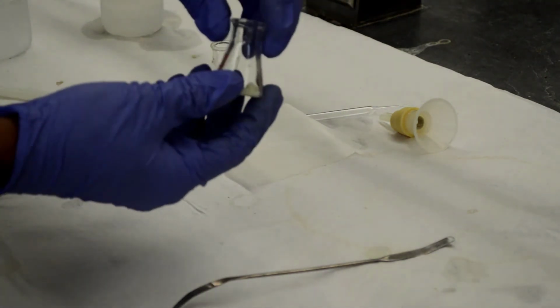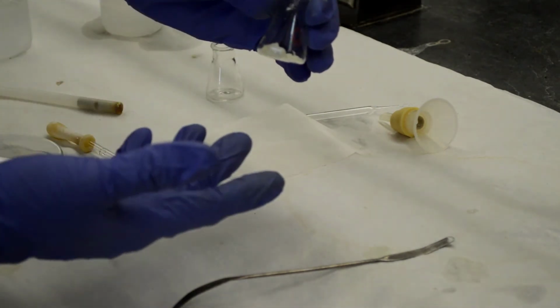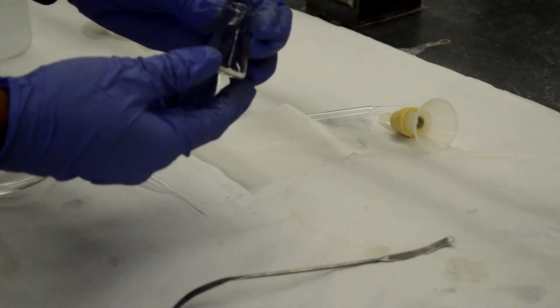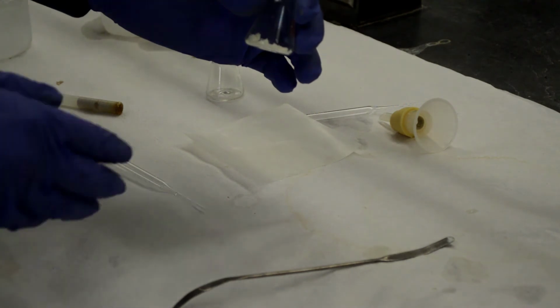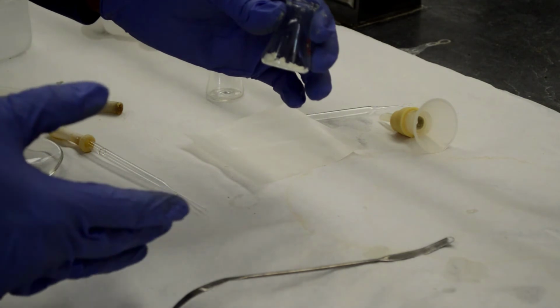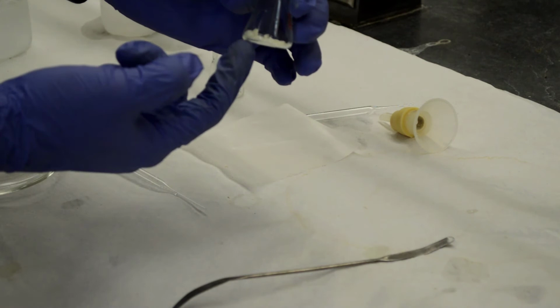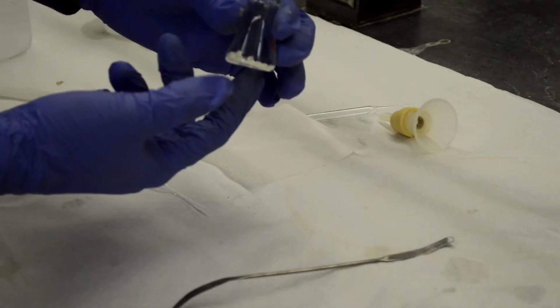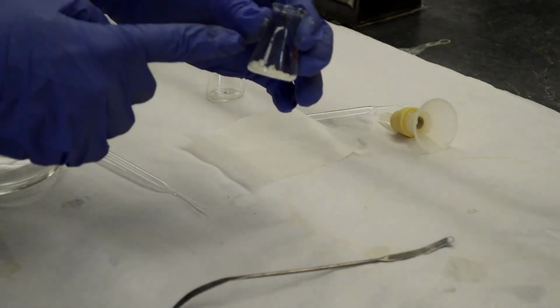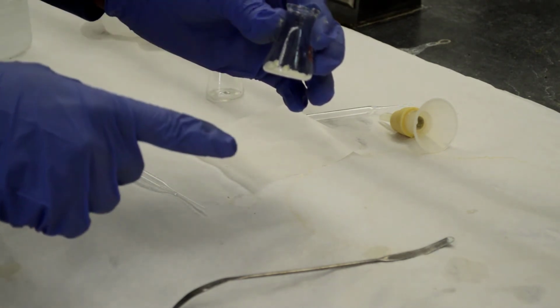This product is crude, which means we have some product that we want and some contamination. The contamination could be the unreacted products or reagents. We're going to remove those contaminations or impurities using a solvent, methanol. The methanol solvent will dissolve both the product and the impurities at a higher temperature. When you cool down the mixture, your pure product will selectively crystallize while the impurities are still dissolved in methanol.